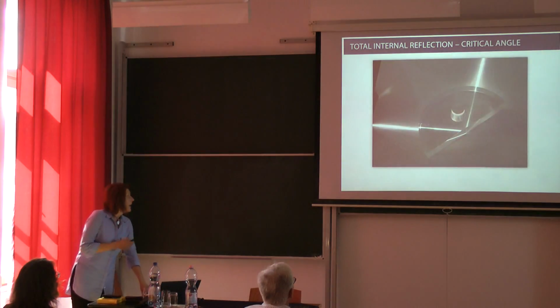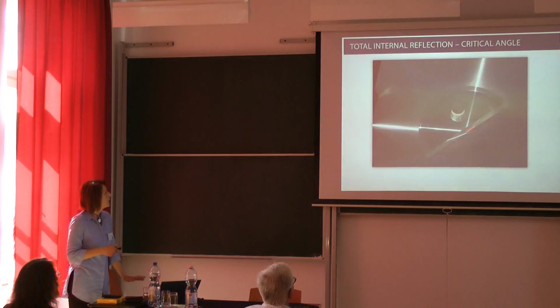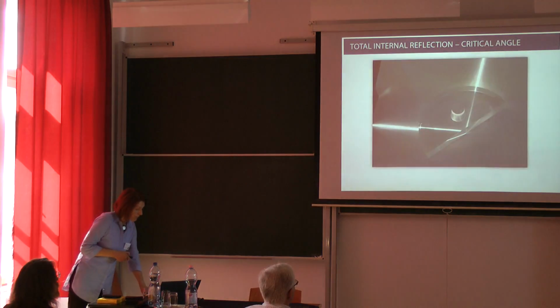This is what happens if you illuminate a glass-air boundary, and here you can see that the light is reflected upon total internal reflection.